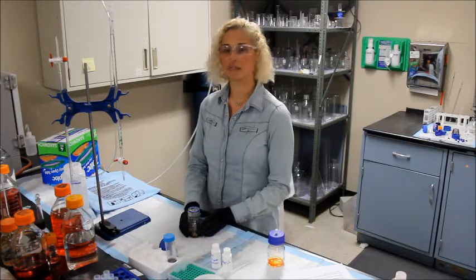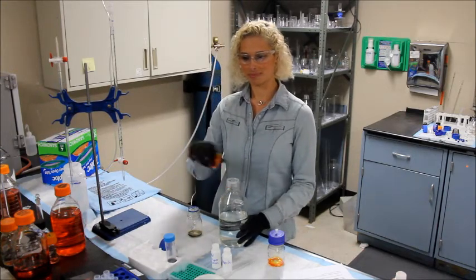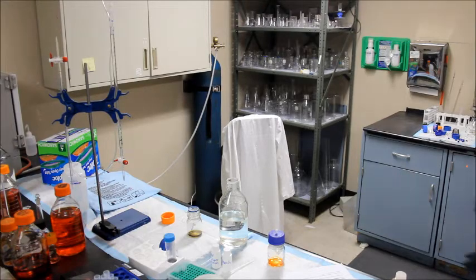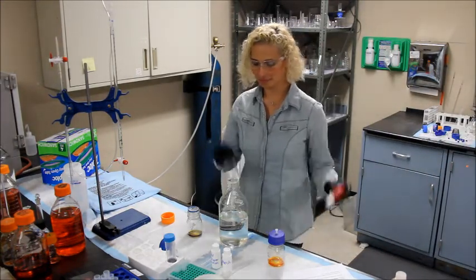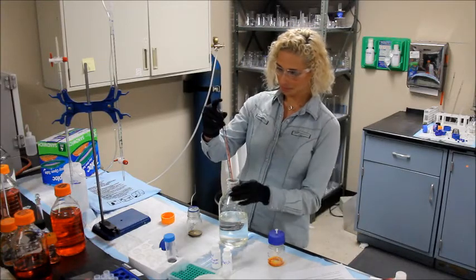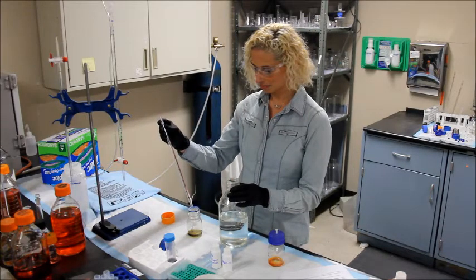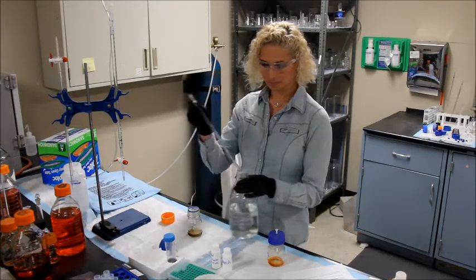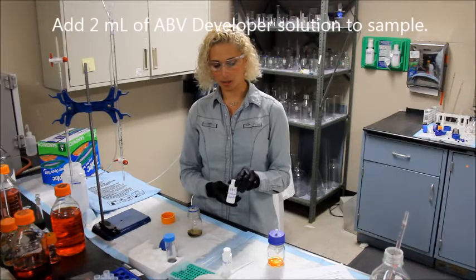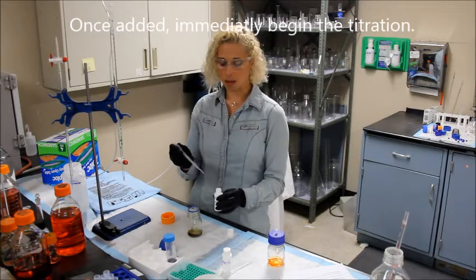You will now add 10 mls of ultra-pure deionized water. Now you're going to add 2 mls of the ABV developer solution. Once you add the solution, immediately begin adding the titrant slowly in a dropwise fashion.